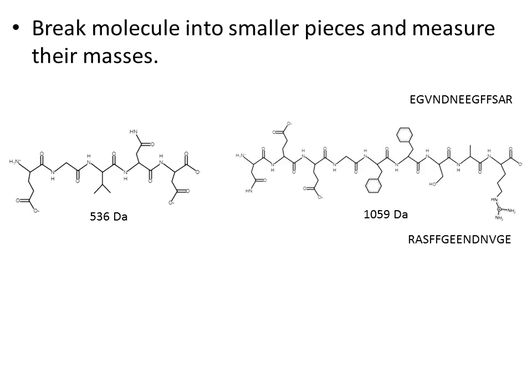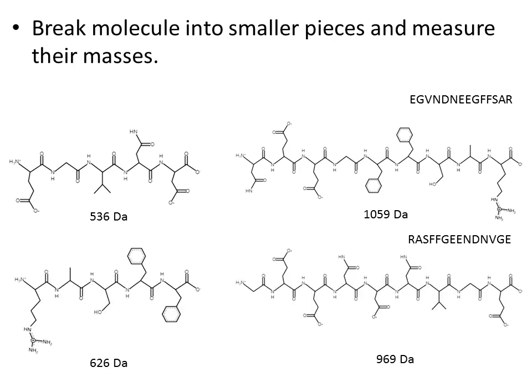If we take the reverse peptide sequence and break it again between the 5th and 6th amino acid, we get two different sized fragments of 626 and 969 Daltons. So even if these two peptides were mixed together and the mass spectrometer selected the mass of 1570, the mass of both intact peptides, the different masses would tell you that more than one peptide was there.